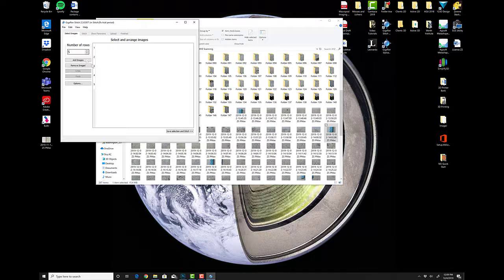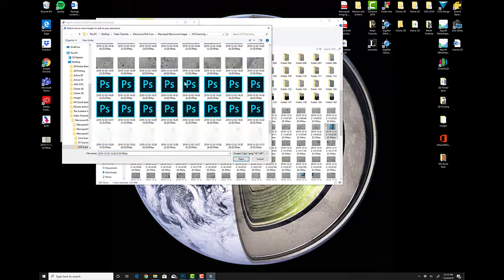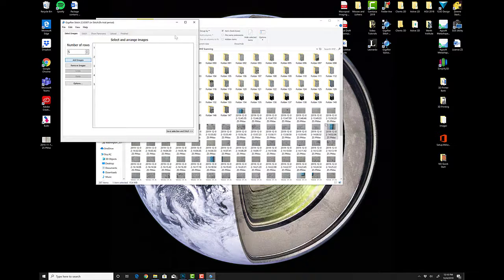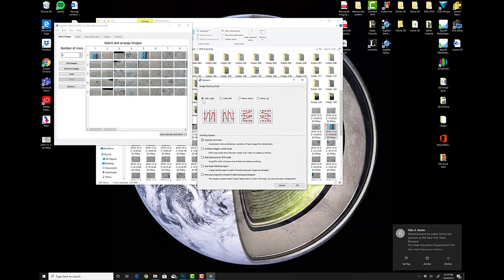And the way it works is initially you'll add all of your final output images. So we're going to select and highlight all of those. Press open. It's going to pull it into this window over here. And you can see that it's starting to look a little funky. We have 4 images and then all of a sudden it resets, and that's because it's programmed right now to do columns and then rows. You can see here, that's the default.